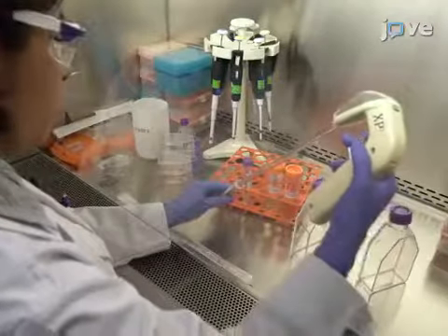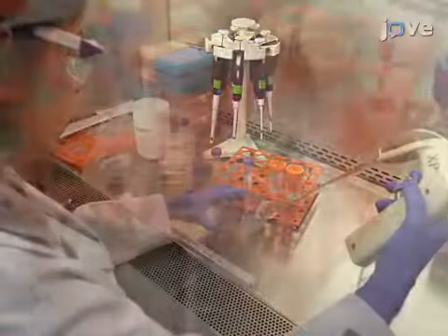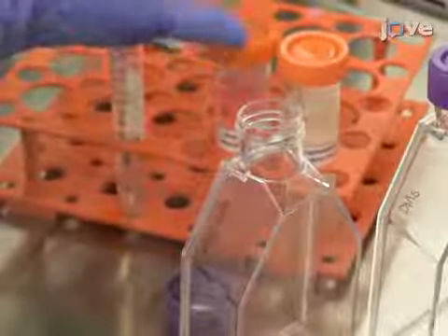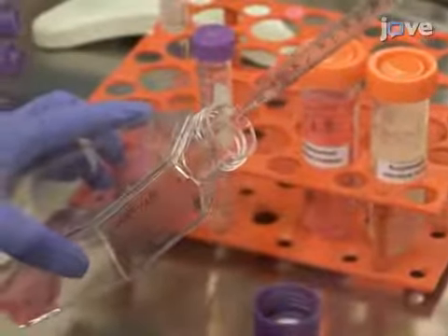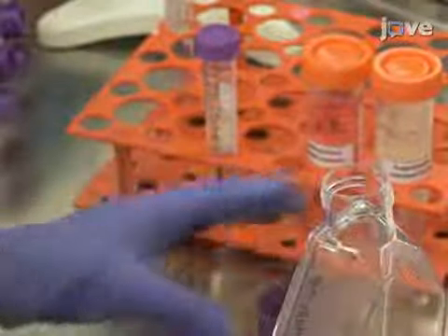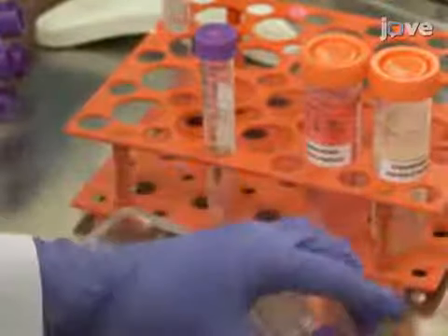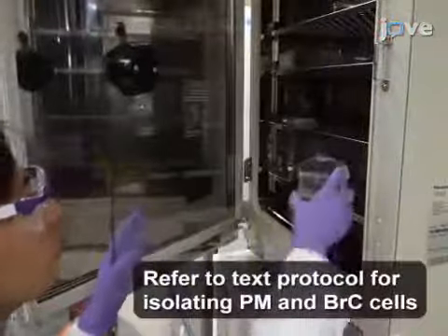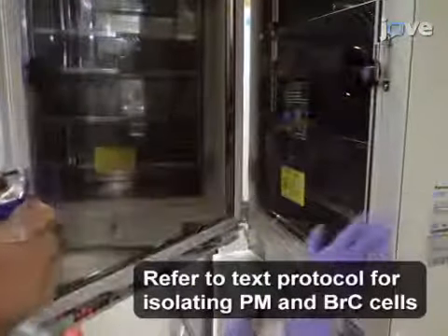To begin, cultivate 2 × 10⁶ U937 and THP1 monocytes in 10 milliliters of RPMI 1640 medium, supplemented with 10% FBS and 1% antibiotic antimycotic. Also cultivate fresh PMs in supplemented DMEM F12 medium. Incubate the cells at 37 degrees Celsius in a humidified 5% carbon dioxide environment.